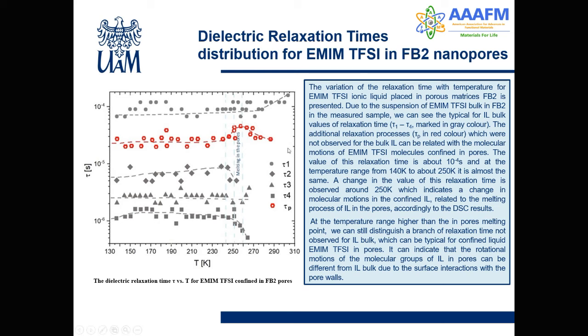Analysis of the dielectric relaxation time shows that we can see an additional branch of the relaxation time. The gray points are the relaxation time related with the behavior of the bulk substances, but we can see an additional branch which changes at the pore melting point, and it is lower than the relaxation time typical for the bulk substances below the melting point.